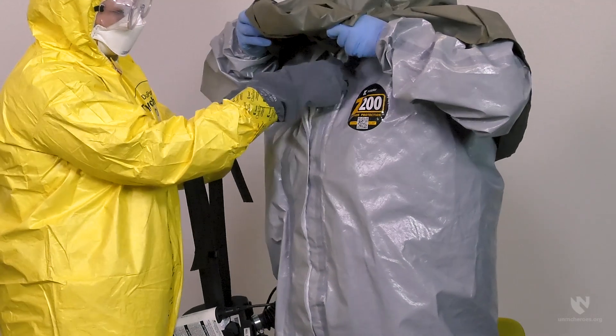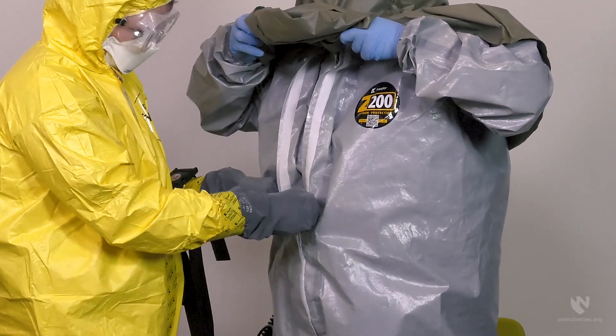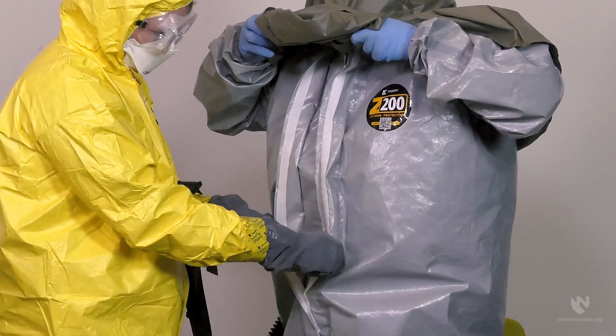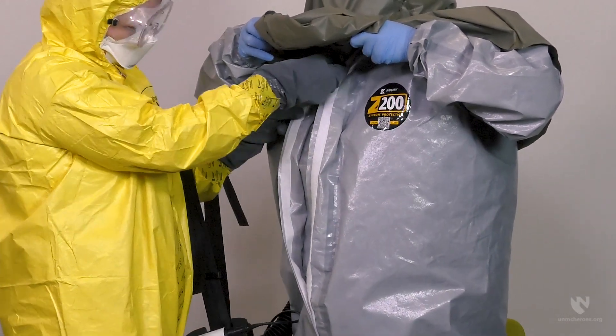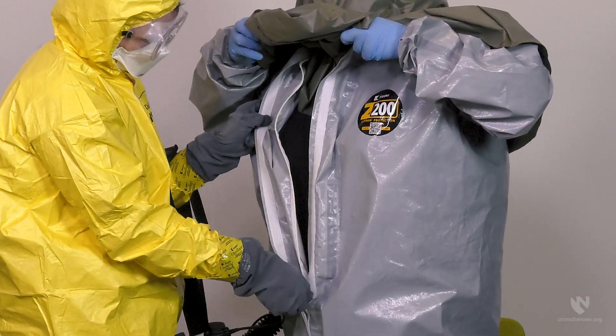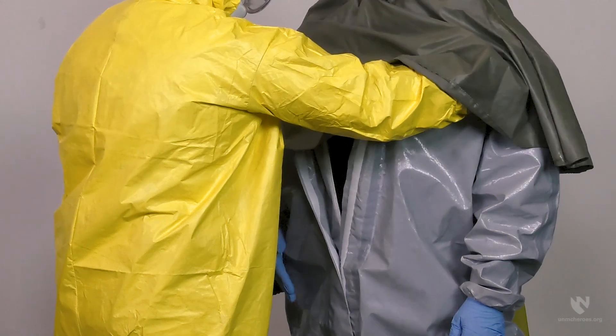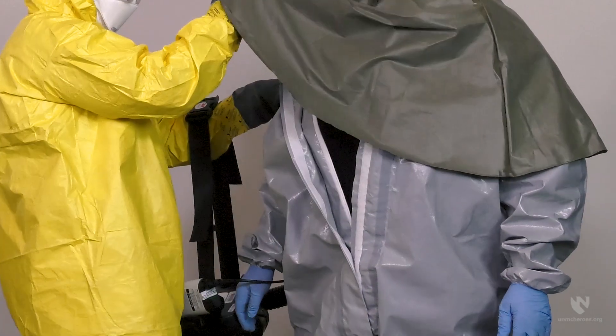The doffing partner should then open the exterior zipper seal, unzip the suit, and begin to remove the suit. Touch only the exterior surfaces as the suit is removed from the shoulders. Do not reach inside the suit at the shoulders when starting the removal process.